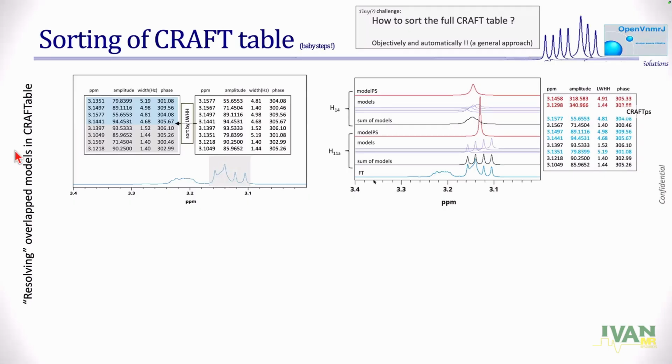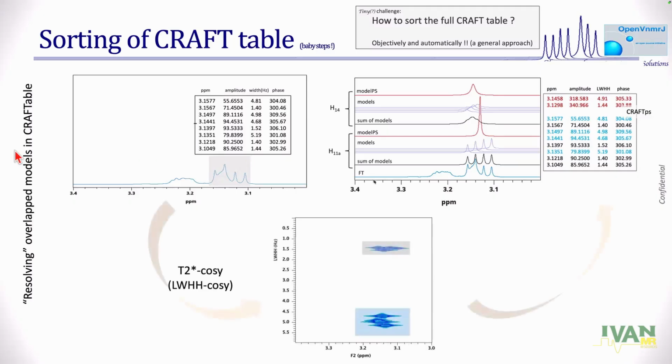I like a spectrum to direct. So I want to be able to put 2 cursors on either side. You can't erase NMR out of me. I say put 2 cursors and show me the table in this frequency region. I don't even want to see the tables. Yeah, it's a huge table. It's a waste of my time or waste of my energy.